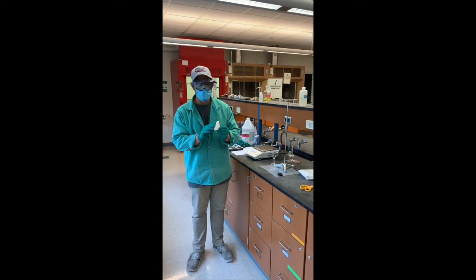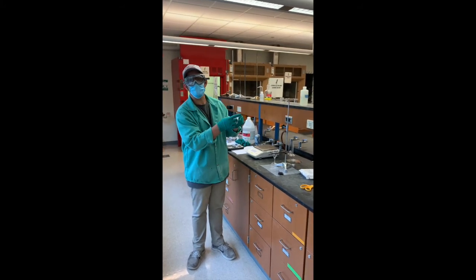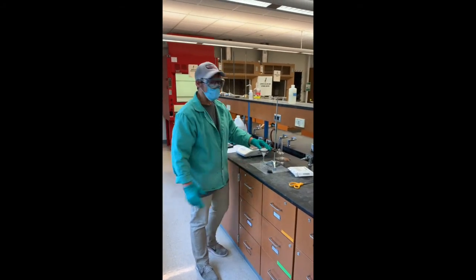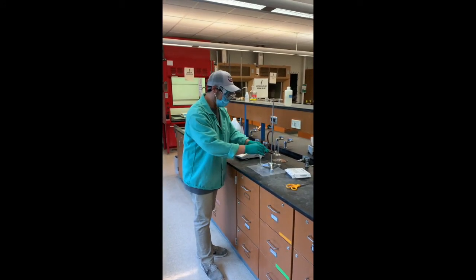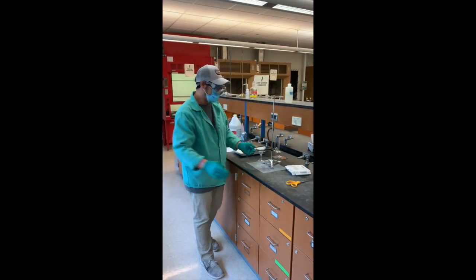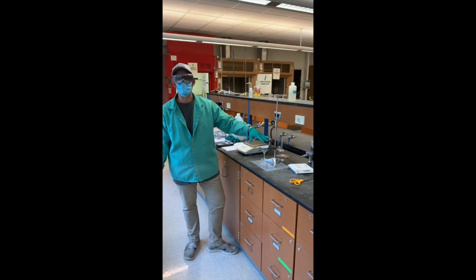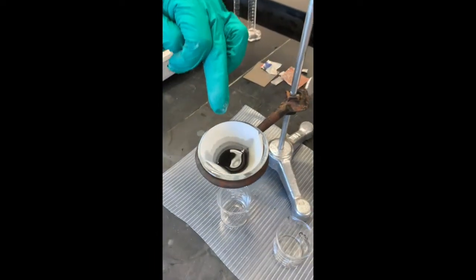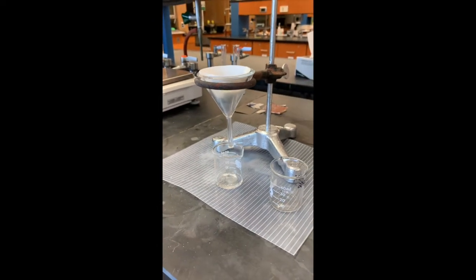Folding a filter paper in half and then in half again will give you your filter, and holding it in place, we will add our solution. This will allow your filtrate to come off and leave you with the impurities, which may be the outer coating, any dirt or impurities which were found on the surface of the aluminum can.